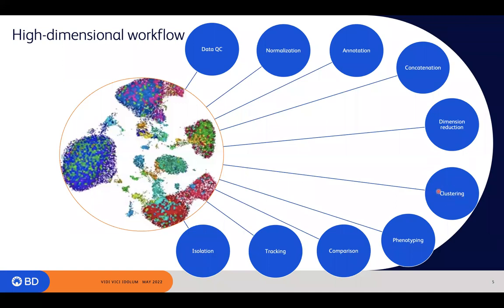Clustering. Clustering and dimension reduction usually go hand in hand. I find that each is useful on its own, but only to a limited extent. I like to use these two sets of tools in combination with one another. So oftentimes, even though I have them separated here, I generally will recommend to people that you use both of these together. Clustering tools are extremely useful for processing large amounts of data very quickly. They also provide a fresh perspective on the data, so we'll take a look at that as well.